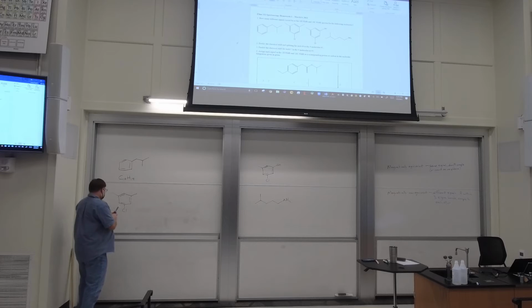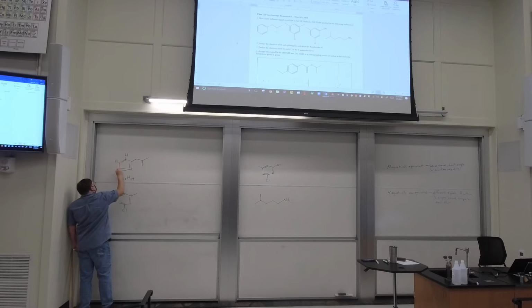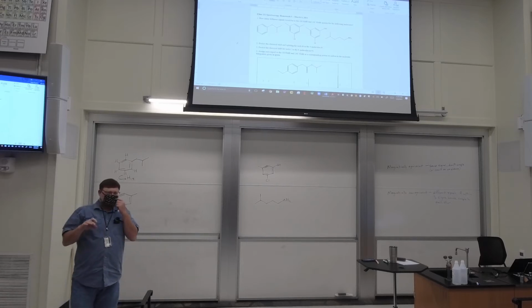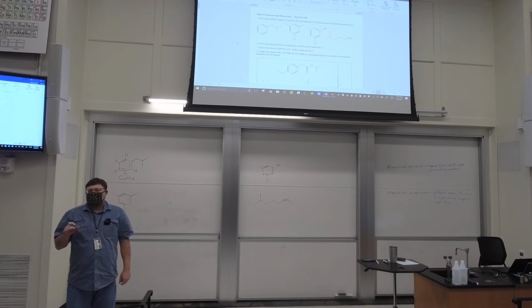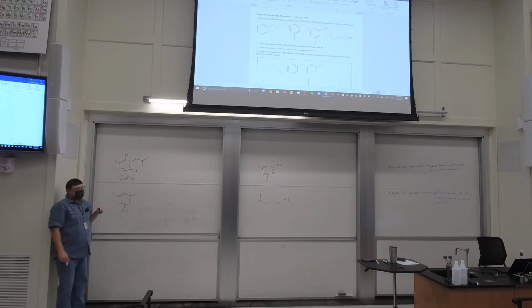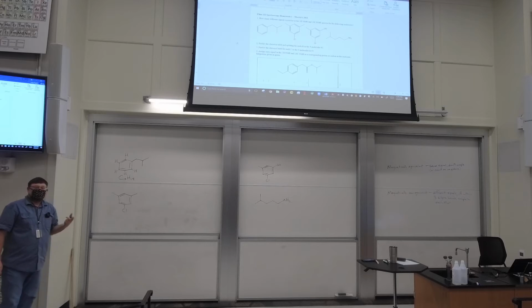Let's look at it. There are 5 aromatic hydrogens. There are 5 protons on that benzene ring. Each one of those protons is on an sp2 carbon. By the way, how many units of unsaturation in this molecule? 4. Right? 1, 2, 3 pi bonds and a ring, so 4 unsaturations. You can get that since C10H14, if it was saturated, would be CnH2n+2, so it would be C10H22. So we're missing 8 hydrogens. 8 divided by 2 is 4.